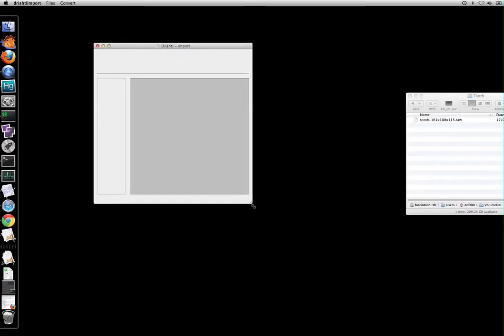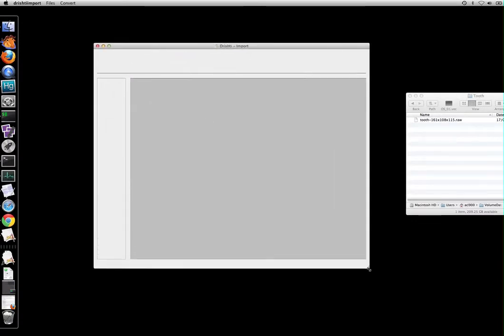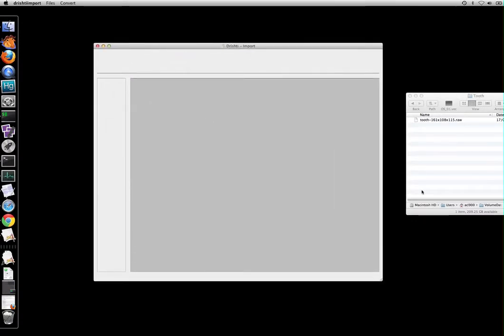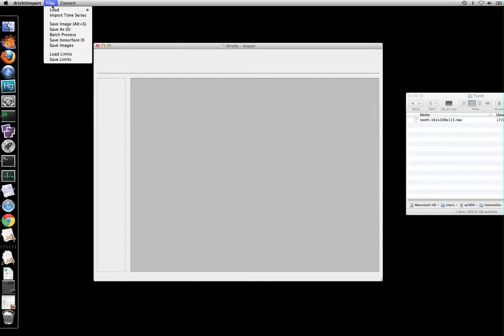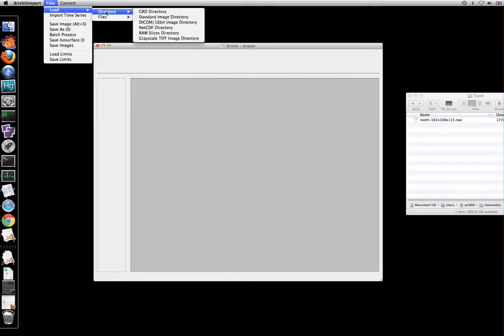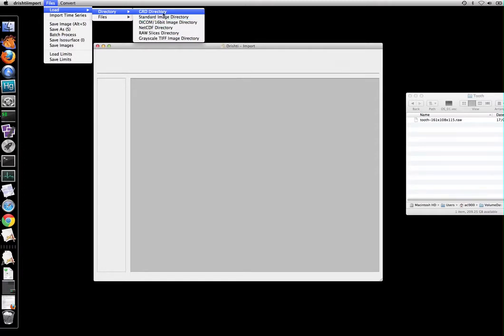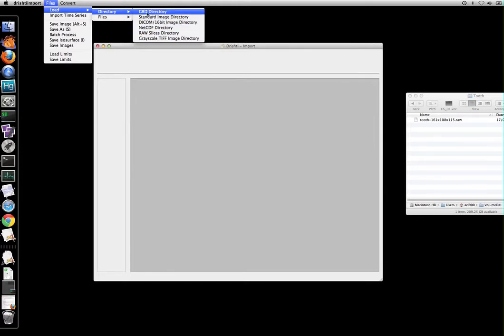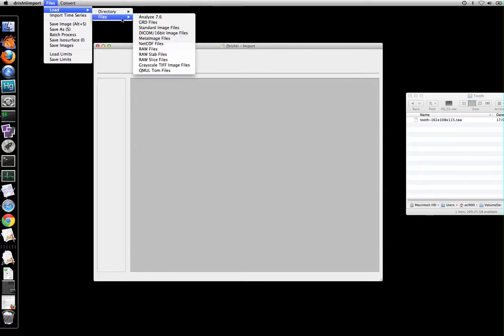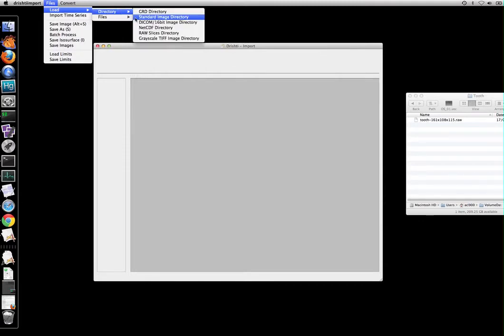Now you can either drag and drop your file or your image stack directory into this Drishti import or you can go here in files and then load your data. If you have image stack or DICOM then you can go through directory. If you have a single file or multiple files then you can just go via the files menu.